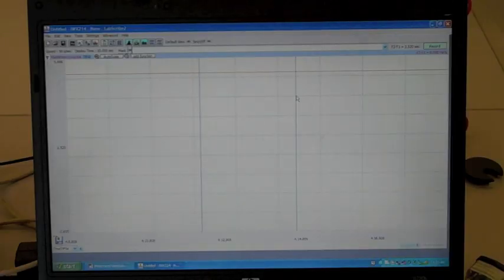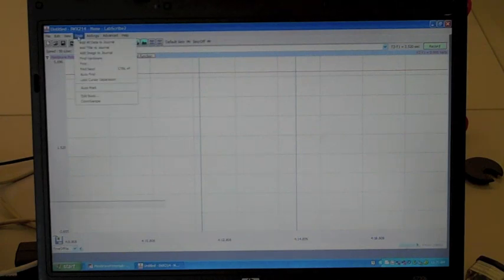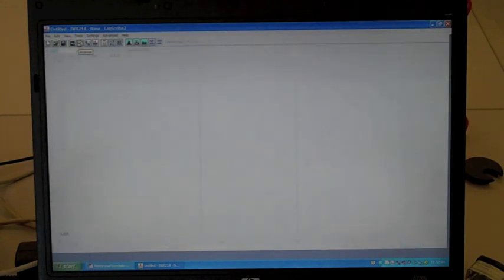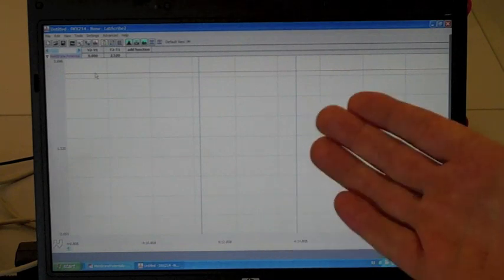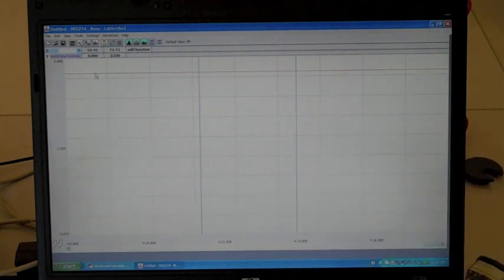So now we've completed our recording, and what we want to do is go back and analyze that recording. In order to do that, we're going to load up the analysis settings. This is under this icon right under Tools. When you click on it, it will say Analysis. And now it's loaded up a very similar window.